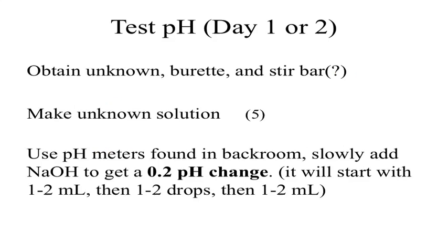That kind of depends on the individual experiment. Get a feel for how your pH is changing. If that pH change is very small, then you need to keep going. If the volume change is very large to generate a small pH change, you're done.